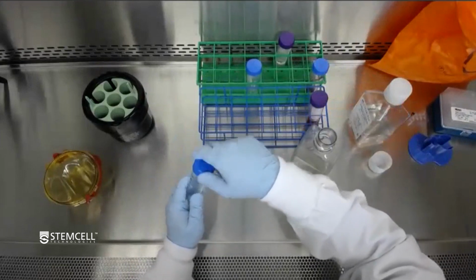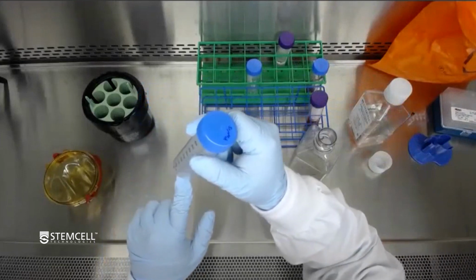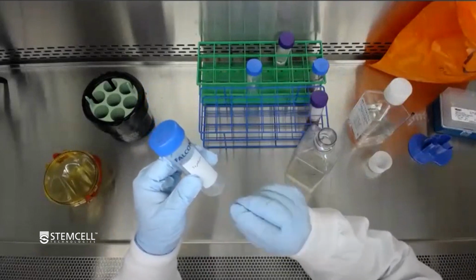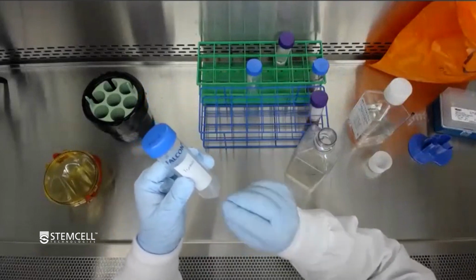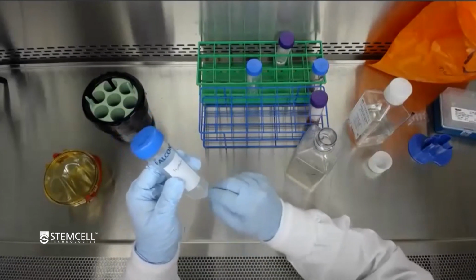And you'll notice that there'll still be a little bit of liquid here at the bottom. What you want to do is just gently agitate that to break apart the cell pellet, because typically we recommend to do a second wash.